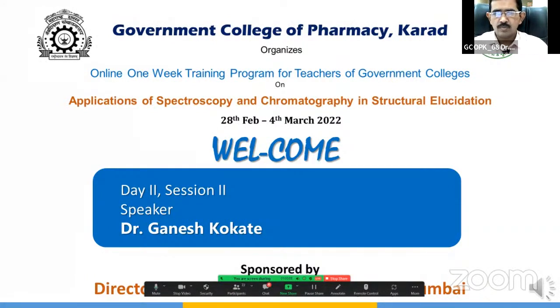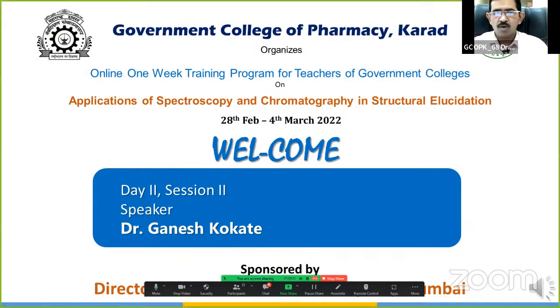And he also does presentations on the basics of HPLC and its applications, basics of LCMS and its different applications depending on customer requirement. And he also focuses on specialized detectors, including RID, fluorescence, ELSD, etc. And he also does the demo of gel permeation chromatography.